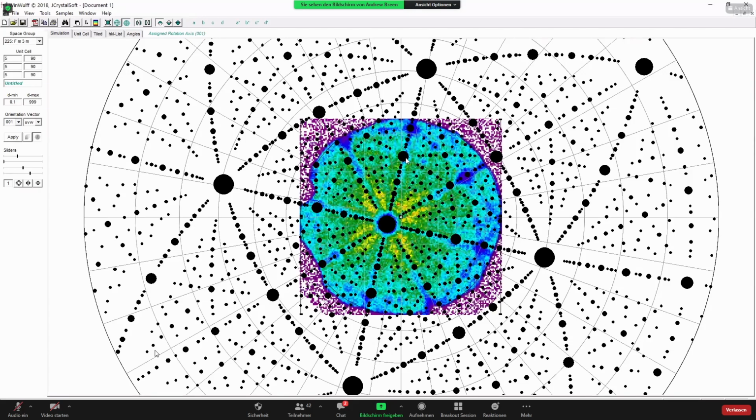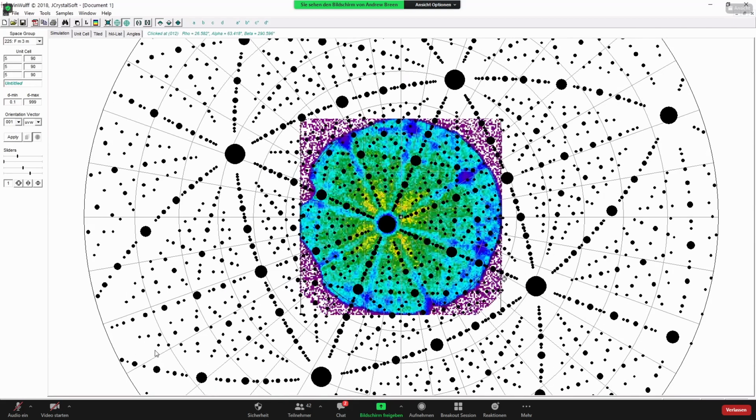So this process can take a bit of time, right? Even for the clear field evaporation images like this, it's sometimes not super easy. I know that this pole up here should be 024, just from what I did earlier. So I'm just going to rotate that around until that matches up with that up there.